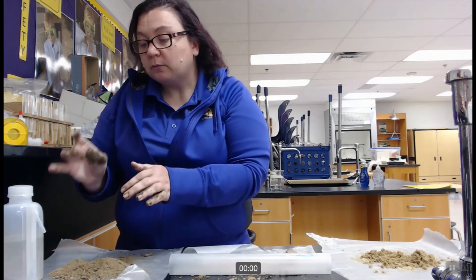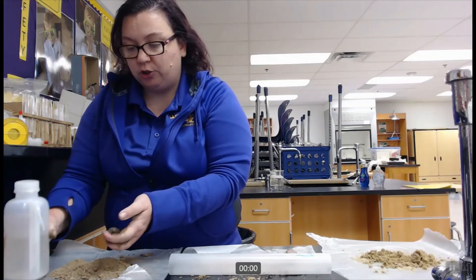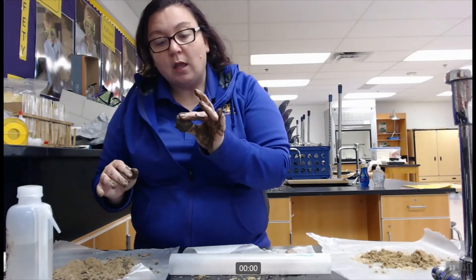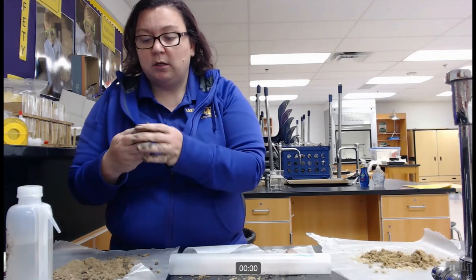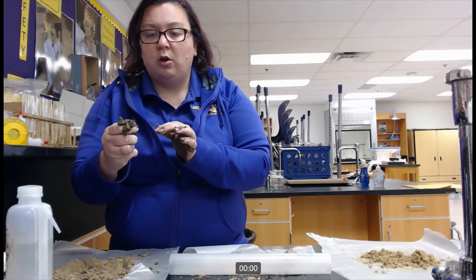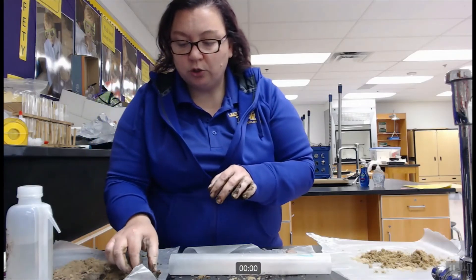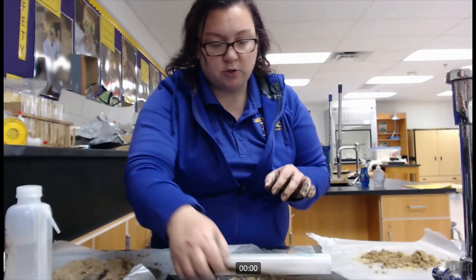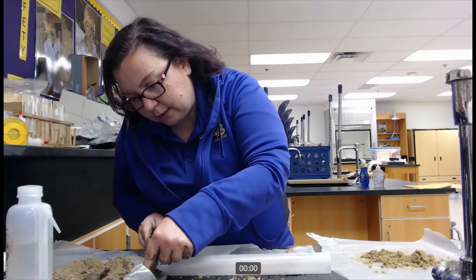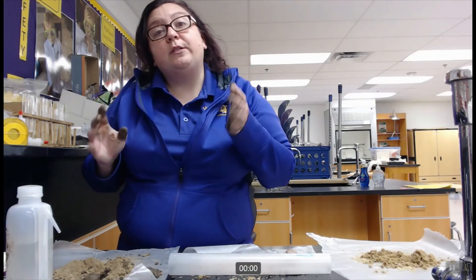As we continue on our soil texture flowchart, we are going to look at that ribbon stage. I have a nice kneaded ball of my unknown soil and I'm going to perform the ribbon test — I just want to squeeze it and push through that soil and see how long it goes before gravity breaks that ribbon. I do get a short ribbon and I can measure that. It is about three centimeters long, right at that two and a half to three centimeter mark.